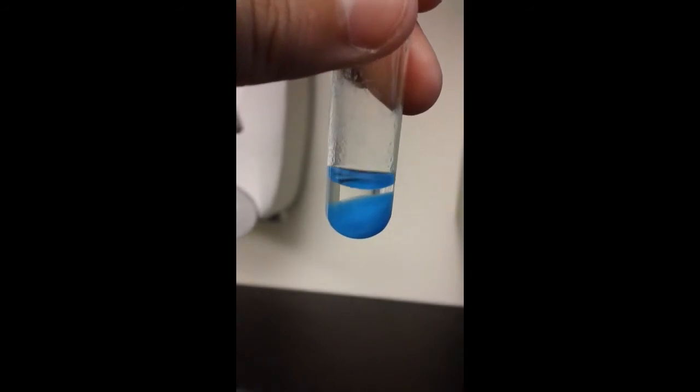Next we have our Cu. So here, note the color and the amount. It definitely looks like we have a solid there. Note the type of solid. Notice how things are stuck to the side of the test tube. Again, this is Cu. Next we have K.